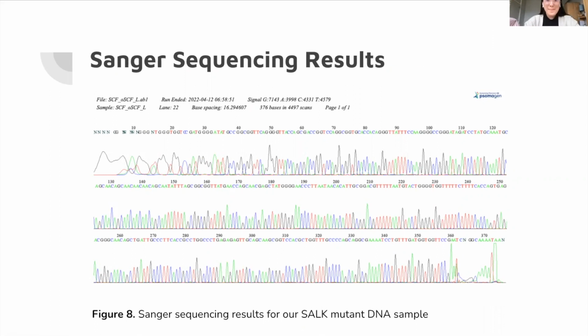We then chose to send in our sample from well 8 of our gel electrophoresis for Sanger sequencing and chose to use our left primer as well, which produces a fragment size of 323 base pairs. We then analyzed the Sanger sequencing results, which showed that the peaks were evenly spaced and the first position of quality sequence data was at 35 base pairs all the way through to 362 base pairs. The Sanger sequencing results also showed that there is little to no baseline noise present.